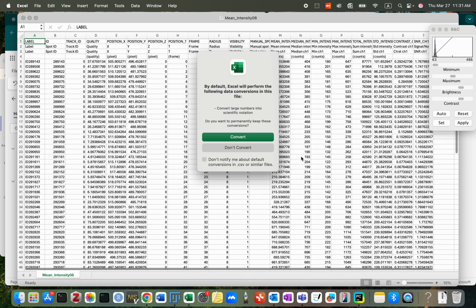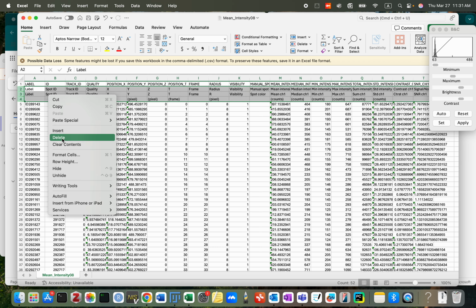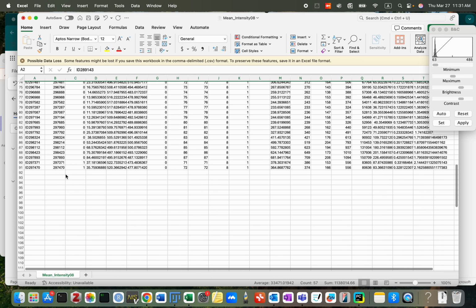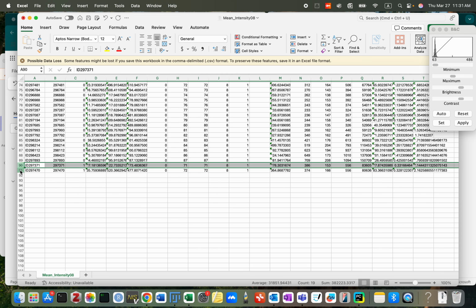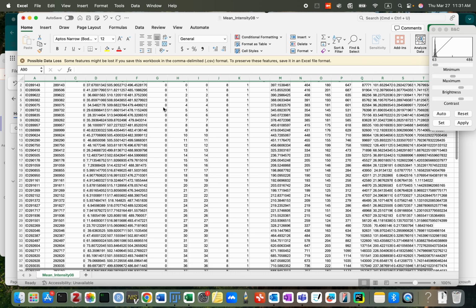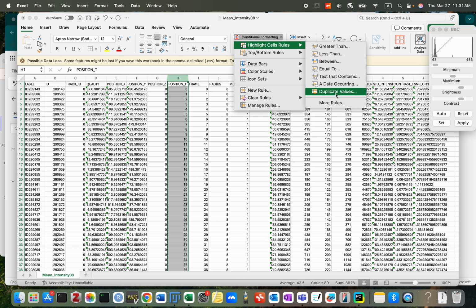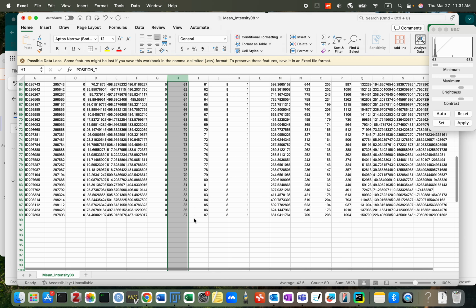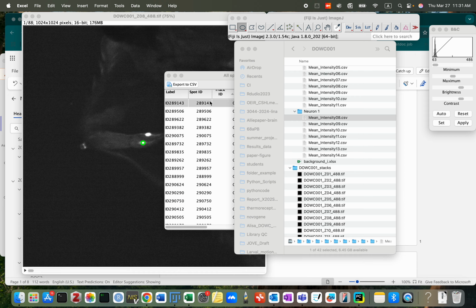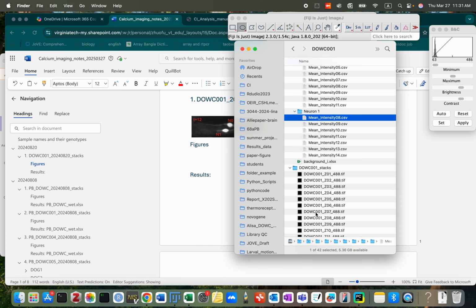Similar with previous stack. And we only have 2 circles named tracking ID 1, which are wrong selections. They are neuron 0. We delete. So then all the others are correct. We check duplicates. No duplicates. Save. Z stack 8, Z stack 7.